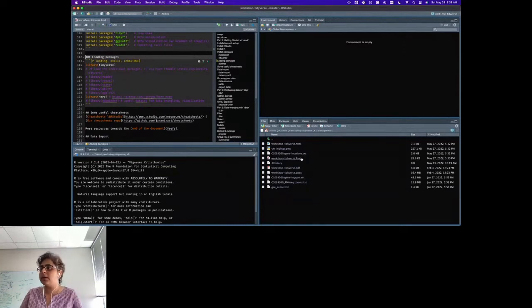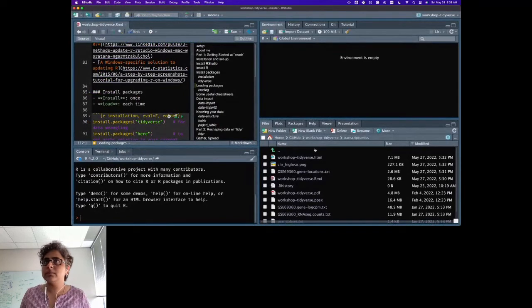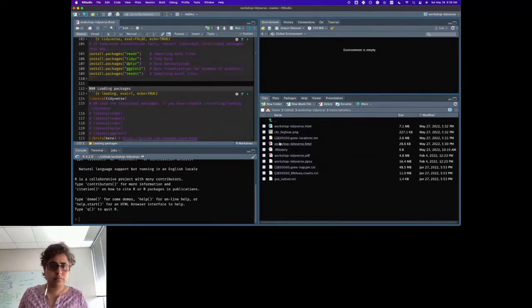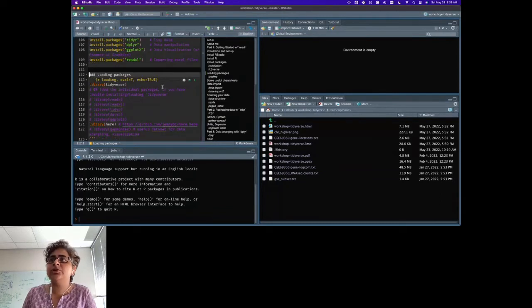So if you have the R Markdown file open, how would you do that? You start here. You go into transcriptomics. Sorry, is this big enough or is it too big? Okay. Are you able to read, all of you? Okay. So you go into transcriptomics and you click on this R Markdown. Here is where you are. If you want the outline and we want to go to specific portions, you can go here. I'm going to loading packages.